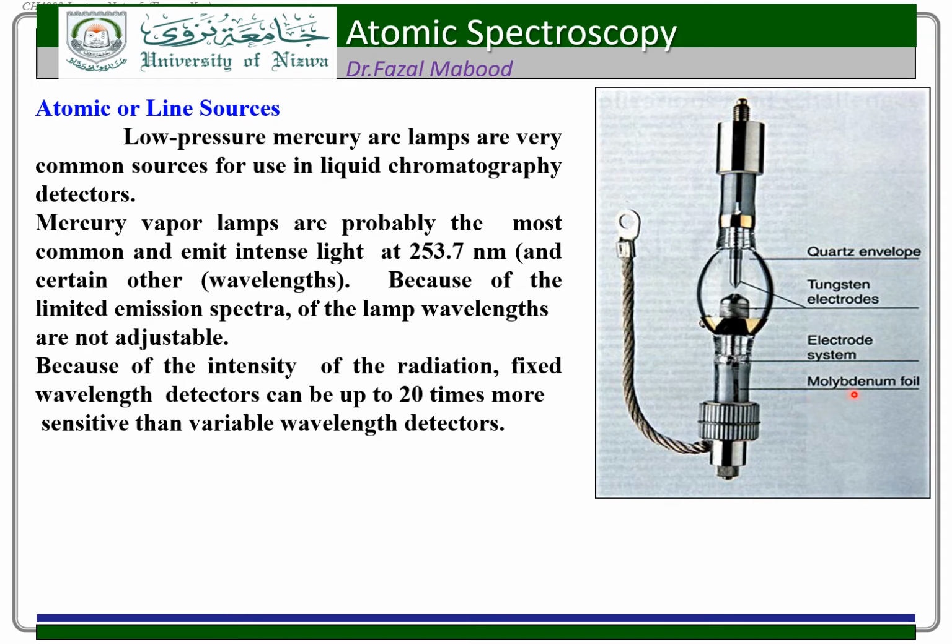Here you see the molybdenum foil, the electrode system, the tungsten electrode. Here this is the tungsten electrode, this is the quartz envelope, and so on.